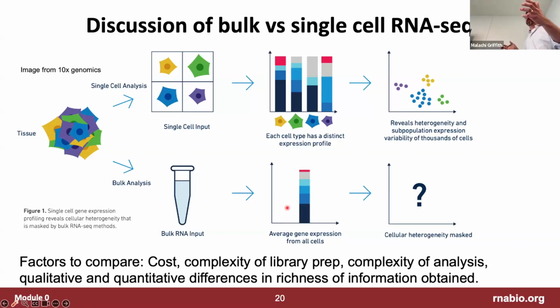So now you figure out what the important transcript structures are, what's there with this deep version. And then you go back to your heterogeneous biological samples that you want to be able to just isolate and sequence directly, and you do the single cell and you combine them that way. Those are just a few examples, of course.